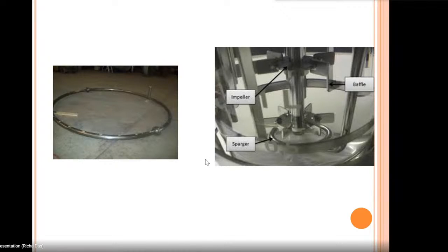Okay. So with this, I complete my discussion on fermentation. What is fermentation? What are fermenters? We saw various parameters, steps of fermentation, and how an ideal fermenter looks. Various parts of the fermenter were also discussed.